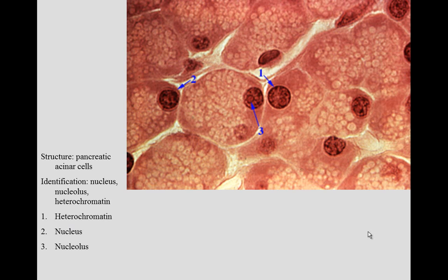Here you can see one of those cells. Here we see number three - there's a nucleolus and here is a nucleus. Another one of those cells showing the spherical nucleus, dark staining heterochromatin and light staining euchromatin.